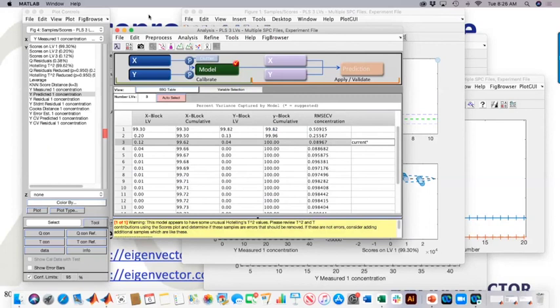Yeah, anymore, my approach to that is build them all and look at the ratio of cross-validation to calibration error versus error cross validation, because that'll show you really quickly what models are overfit, which ones have the best cross-validation error, and if you also then highlight ones of different pre-processings or variable selections, it'll tell you a lot about what's working and what isn't in general.